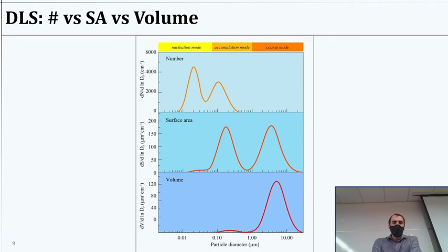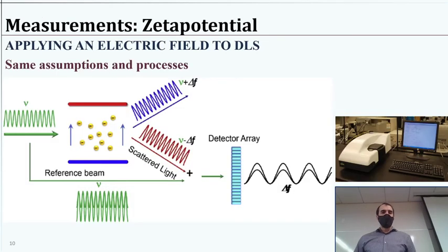And so that's another challenge when dealing with these computations, because what you observe is an intensity measurement, and you have to make sure you're correctly interpreting that into what volume of the water is occupied by particles, and then every iteration can multiply an error if there was an error. So as you go, it highlights the importance of the accuracy, or in some cases lack thereof, of the measurements. Okay, so very useful, not always incredibly accurate, but it does have potential to be quite accurate. That's what, at the end of the day, I would say.